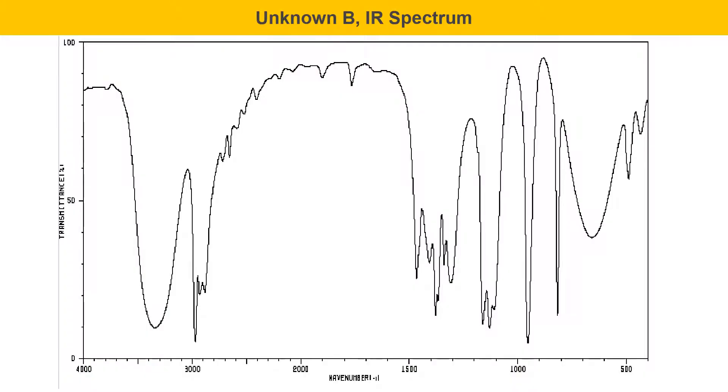The IR spectrum for unknown B is shown here. The important thing for this one is to remember that you're only working on the functional group region of the molecule, and you can just ignore this fingerprint region, which contains a lot of complicated peaks that are difficult to interpret. You just want to get the major peaks in the functional group region, that region between 1,500 and 4,000 wave numbers.